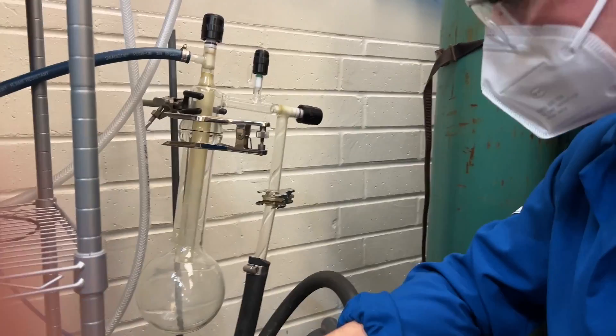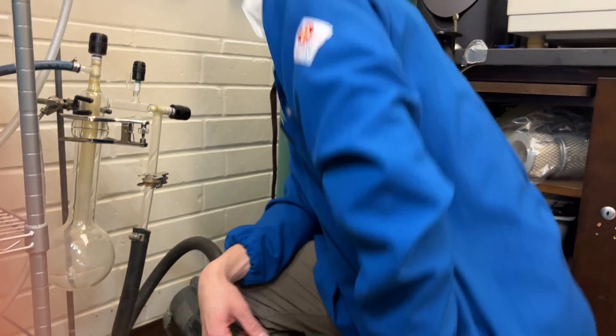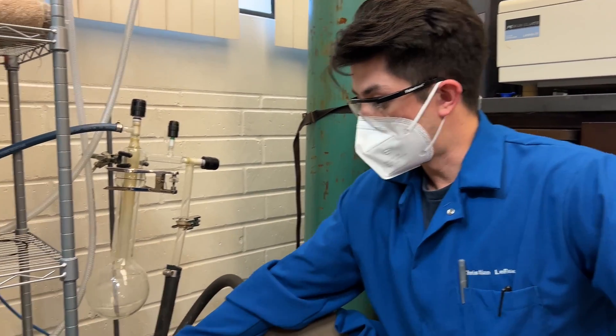Now we have to wait 10 to 15 minutes to make sure that this whole system is under vacuum. Now that the bulb is fully under vacuum, we're going to go ahead and lower our bulb into our Dewar.